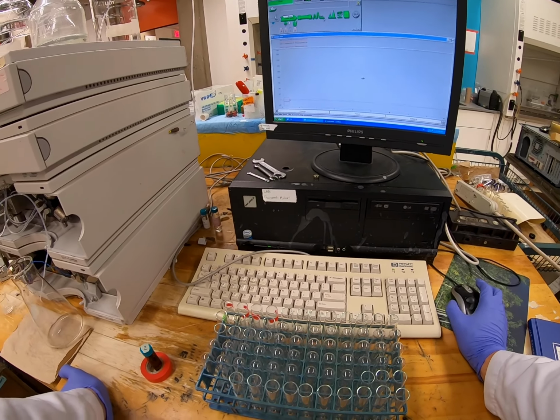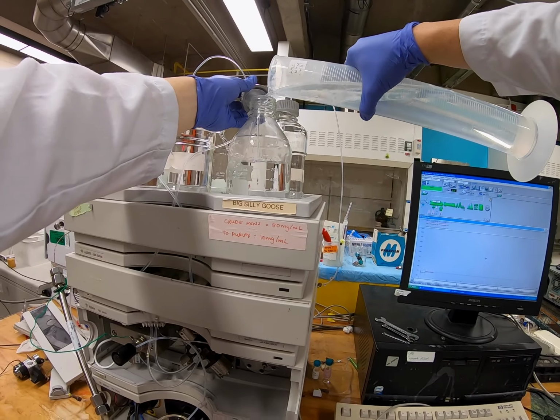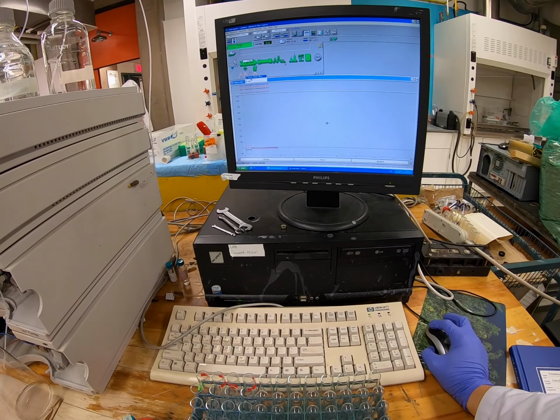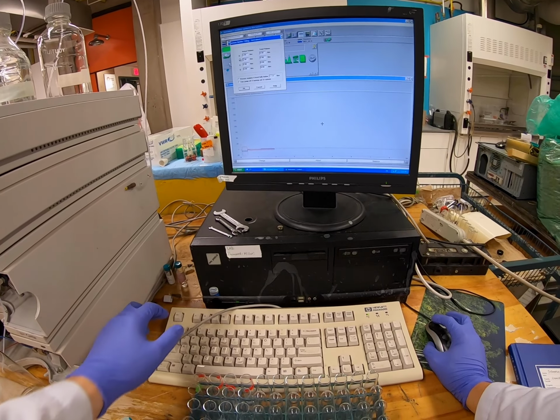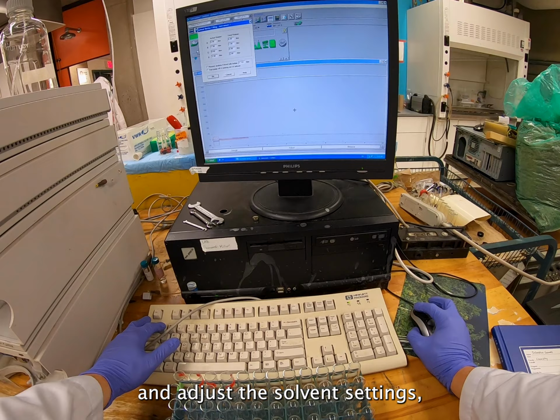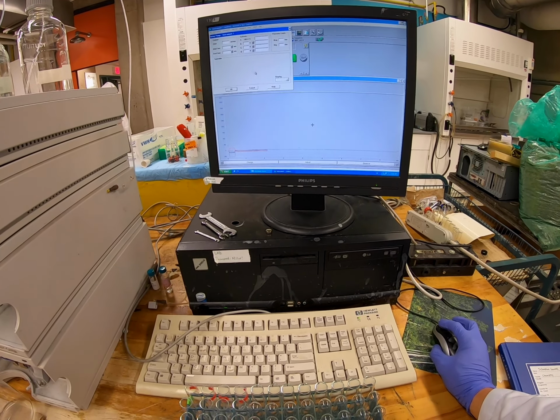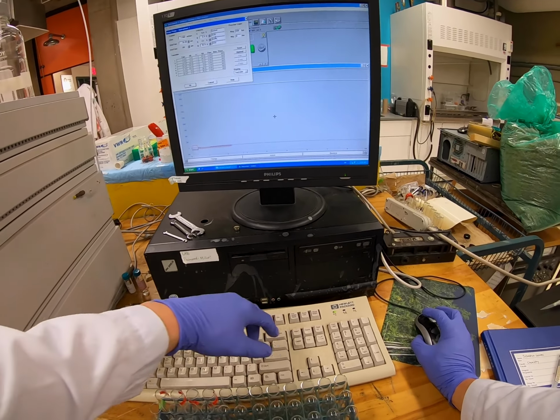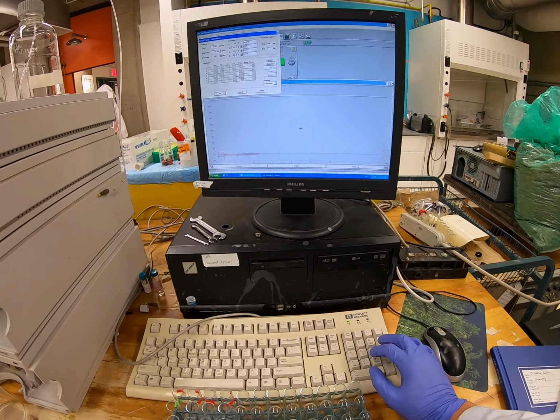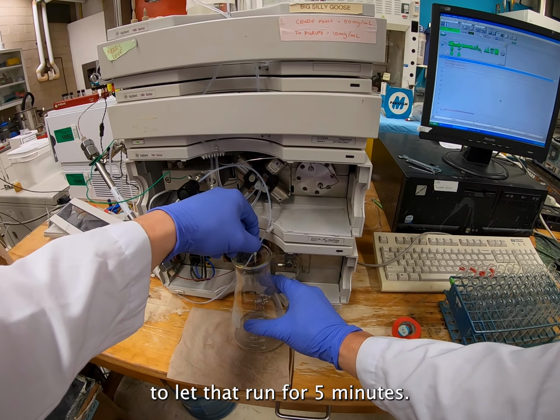Okay, nice. So we're just gonna fill up the solvents. Then adjust the solvent settings. And then flush the column. We're gonna start with 95% acetonitrile and 5% water. And we're gonna let that run for 5 minutes.